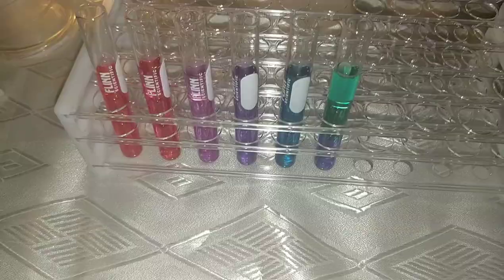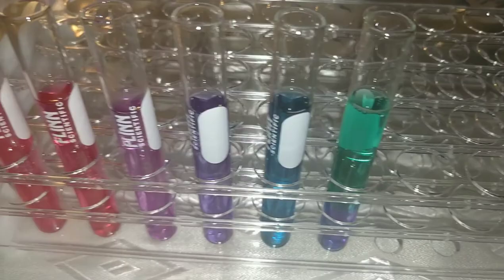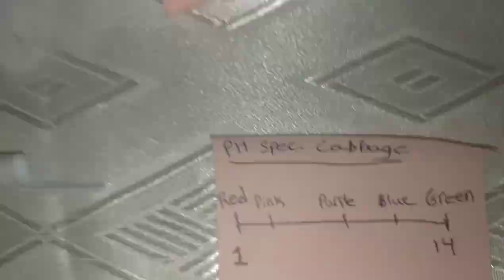Here are the colors put in order: it goes from red to pink to purple to blue to green. That's our color scale for the cabbage juice. Here's the color spectrum I came up with for the cabbage indicator.